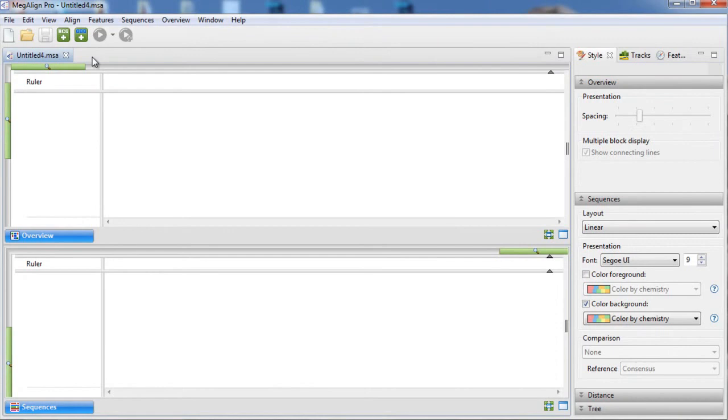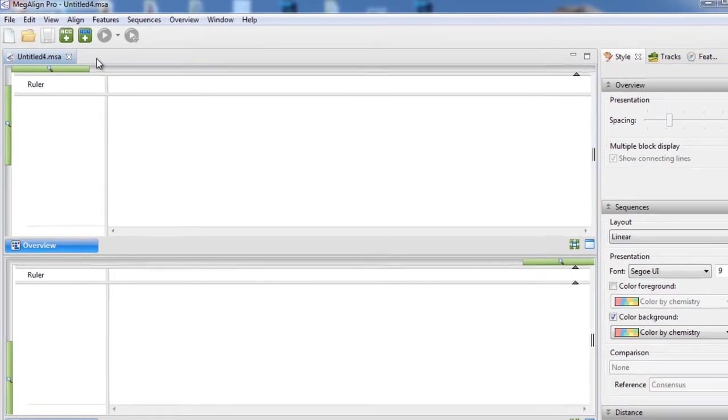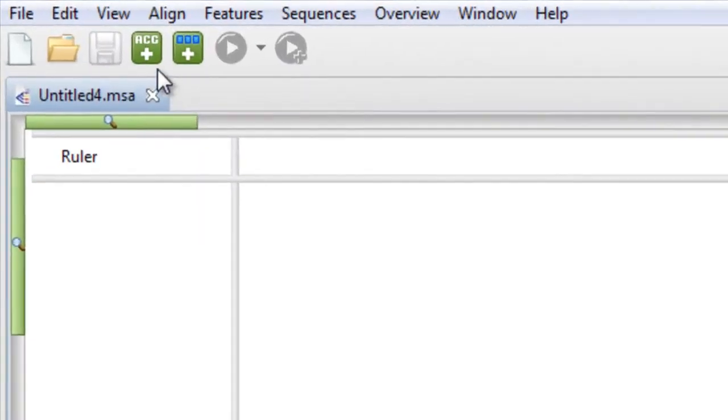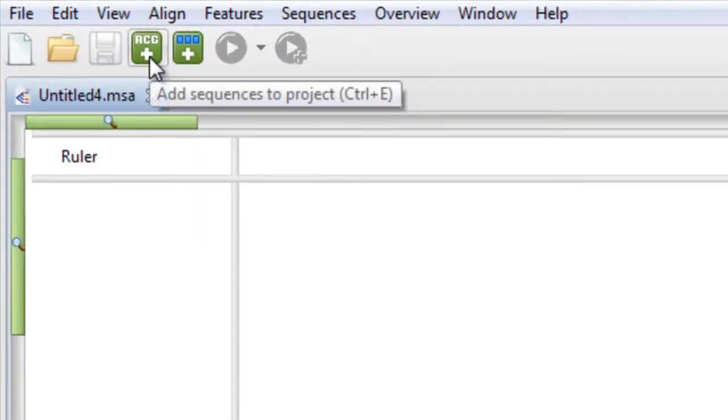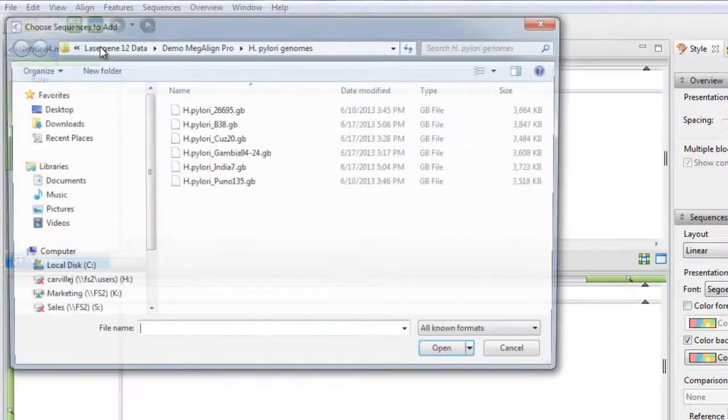First, I'm going to add in some H. pylori genome sequences. I can add these by dragging and dropping the sequences into the project, or by using the Add Sequences to Project tool.